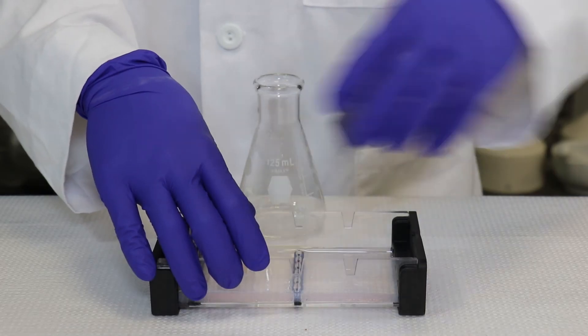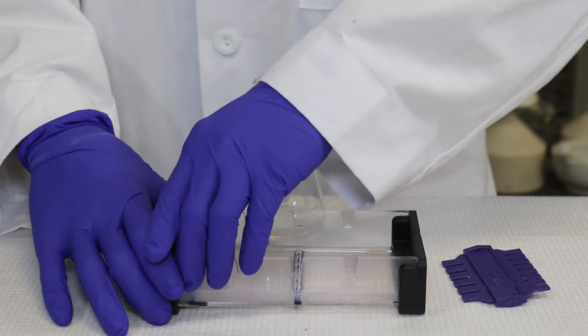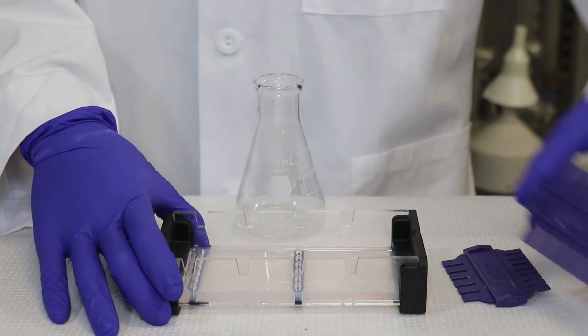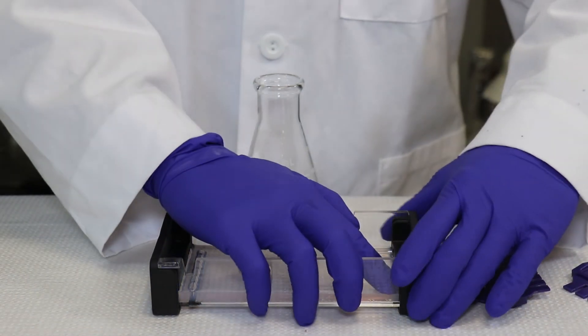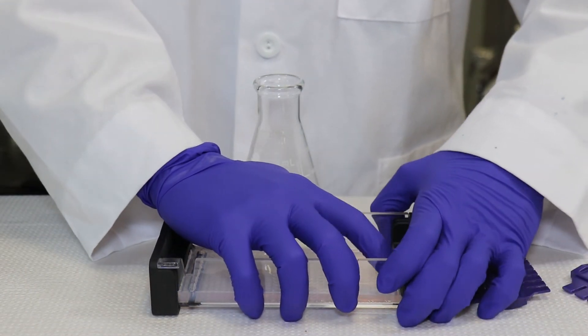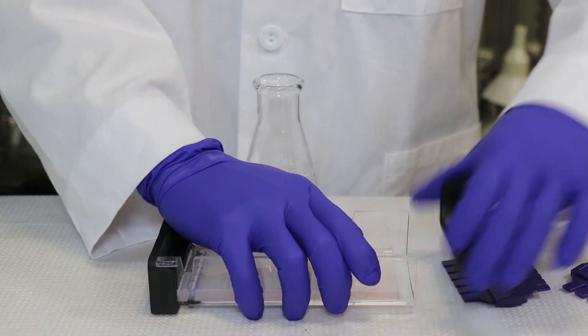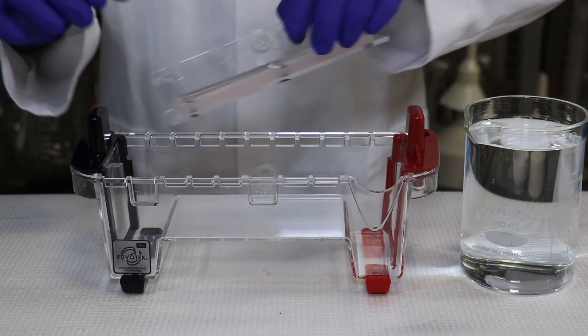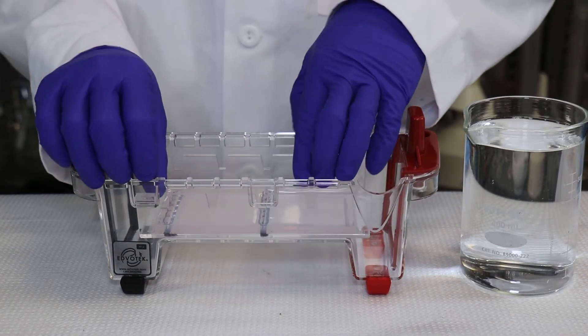Step 7: Carefully remove the end caps and comb. Take particular care when removing the comb and end caps to prevent damage to the newly formed wells. Step 8: Place the gel and tray into an electrophoresis chamber.